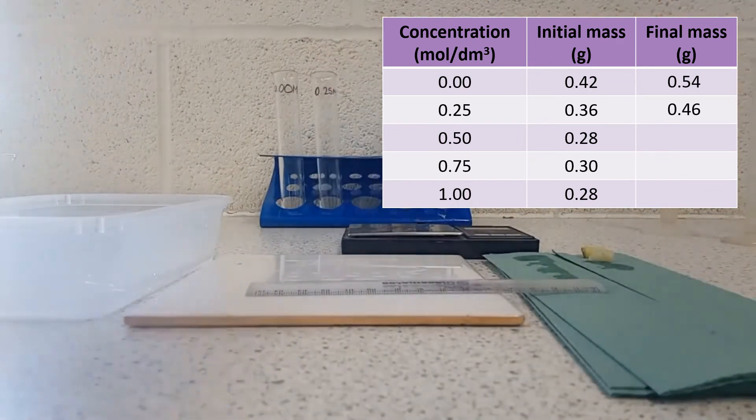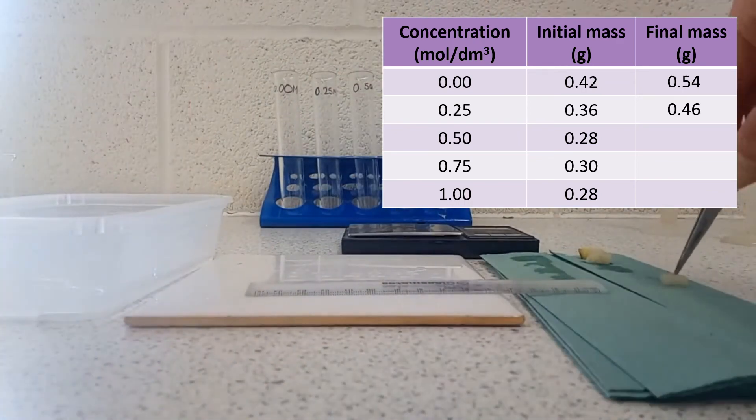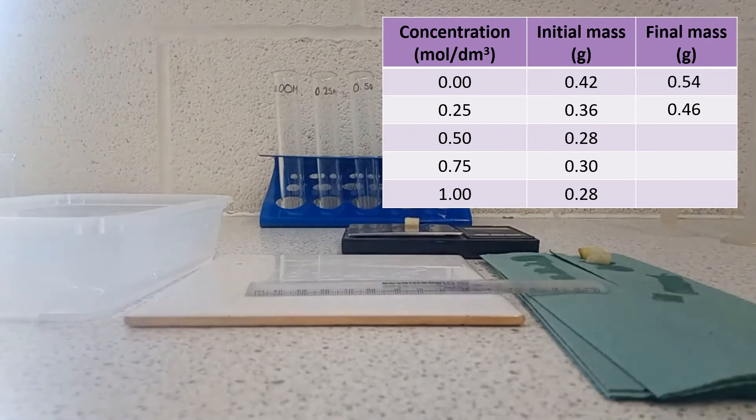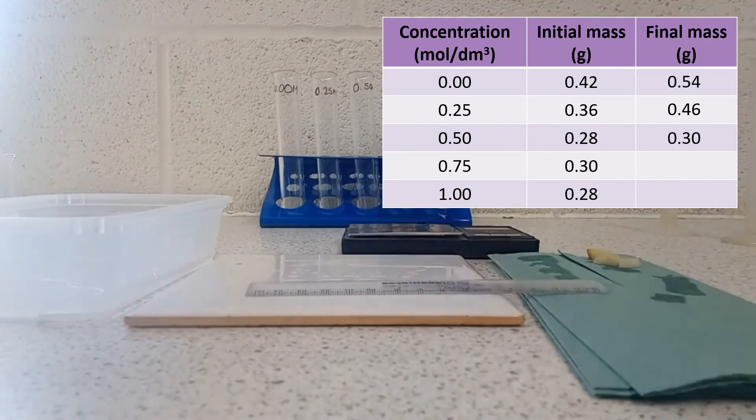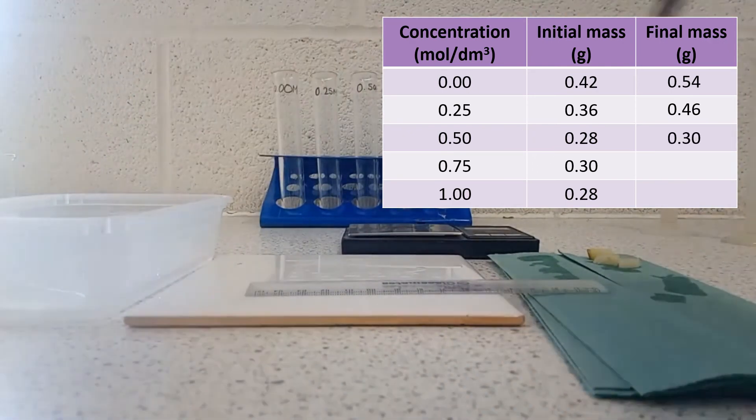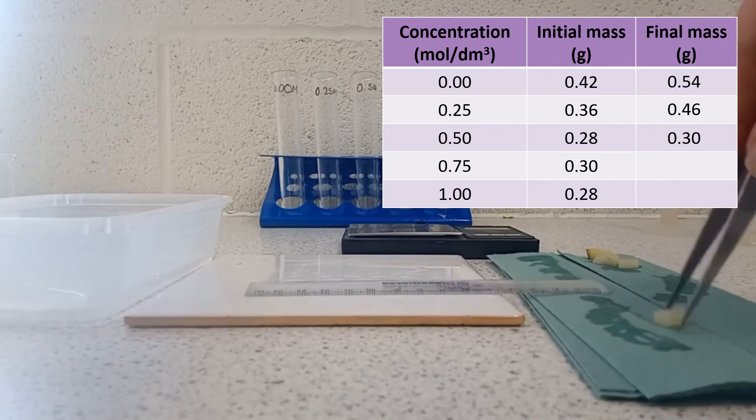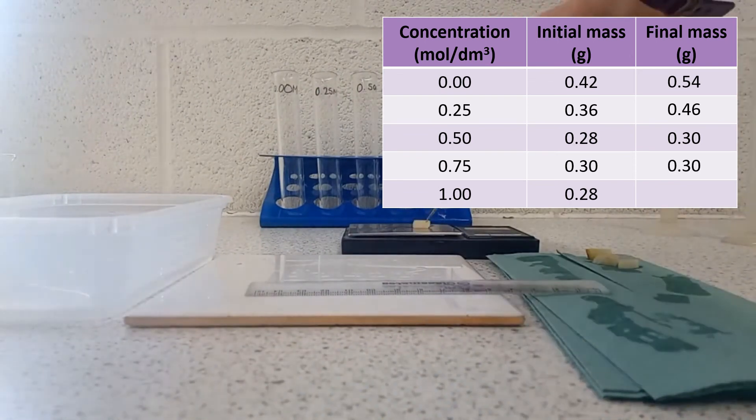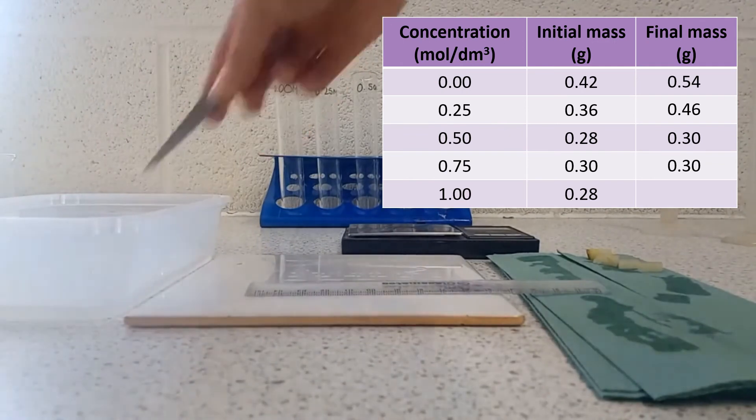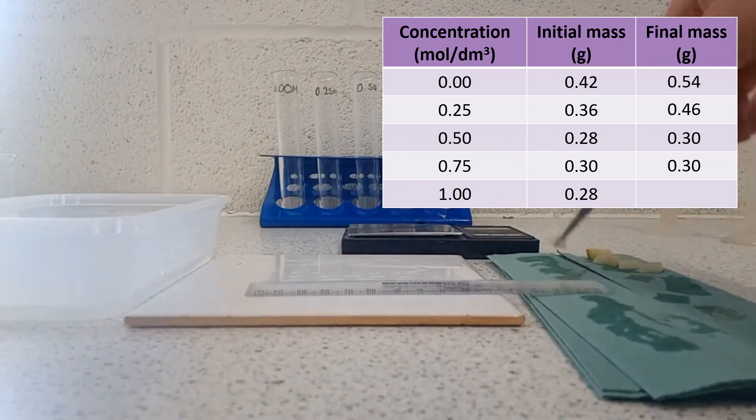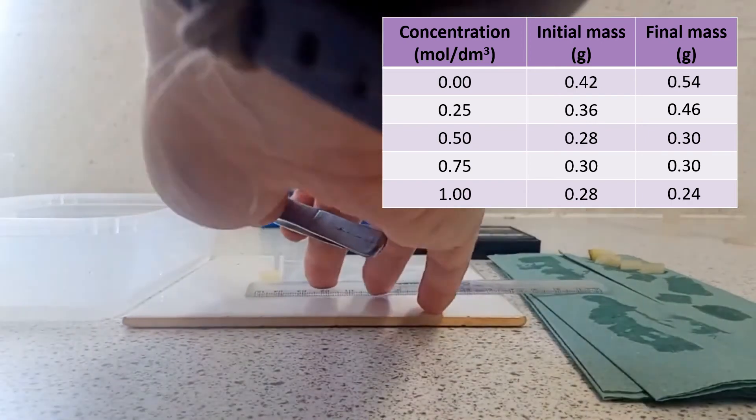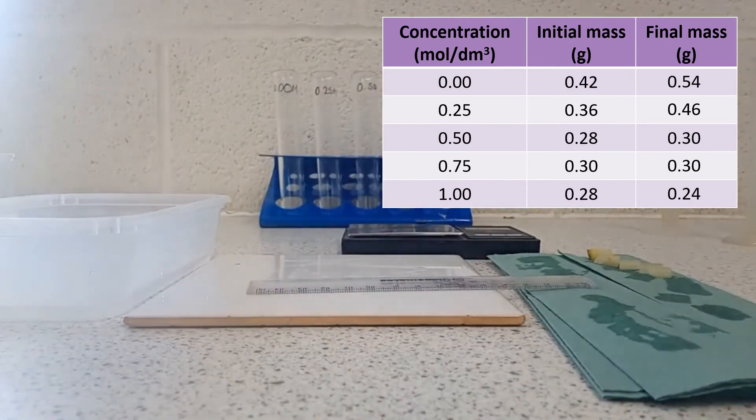Then my second piece now has a mass of 0.46. My third piece now has a mass of 0.30. This piece that was in the 0.75 now has a mass also of 0.30, and my final piece has a mass of 0.24. And that one, I can see, has also shrunk slightly, which again is what I would expect.